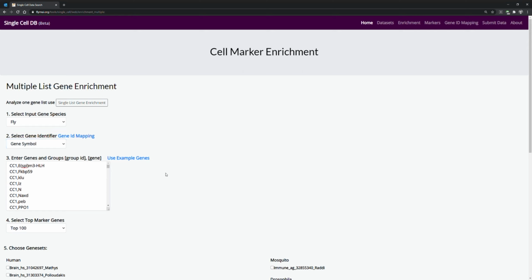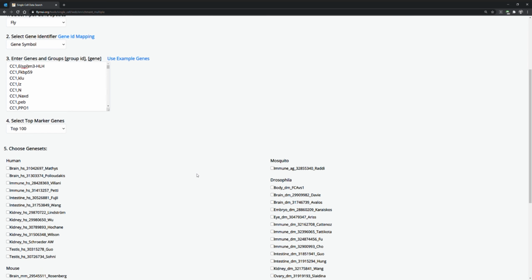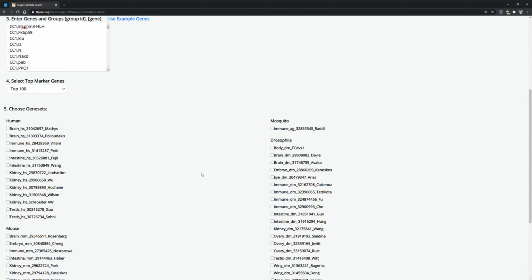And then I'll be comparing these with the markers from a similar study, single-cell transcriptome maps of myeloid blood cell lineages in Drosophila, which is this dataset. And users can do this kind of comparison to validate data reproducibility. In addition, if you're doing this type of analysis with a dataset from a different species, the results can facilitate the discovery of evolutionarily conserved transcriptomic architecture.